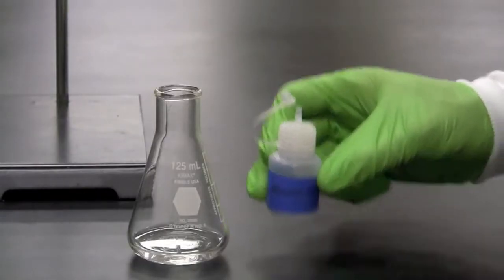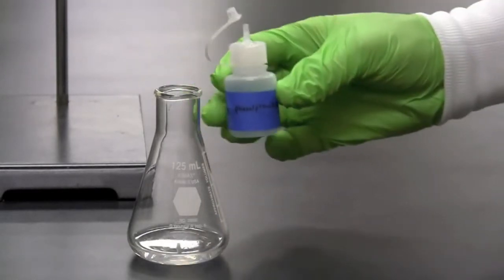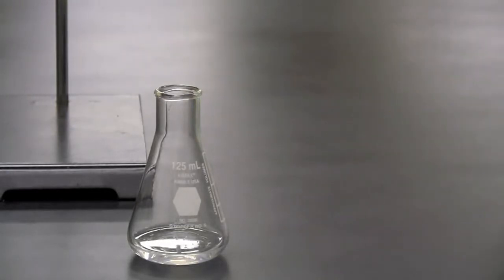Add two drops of phenolphthalein to the hydrochloric acid solution. Gently swirl the solution to mix.